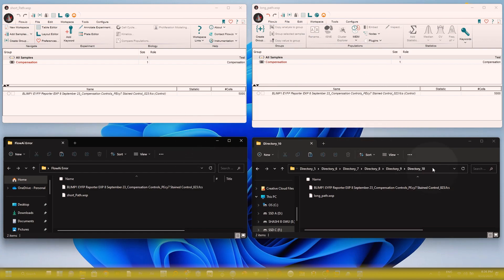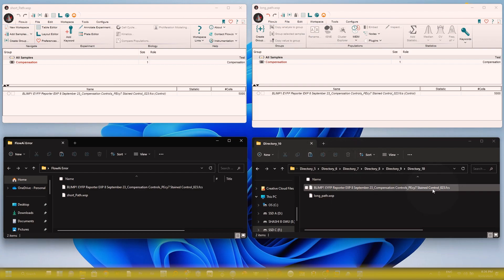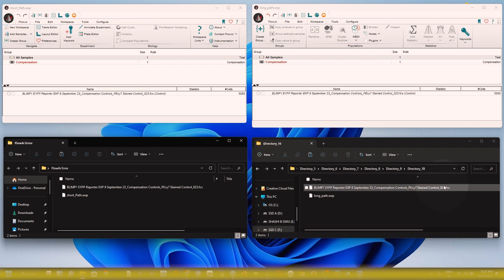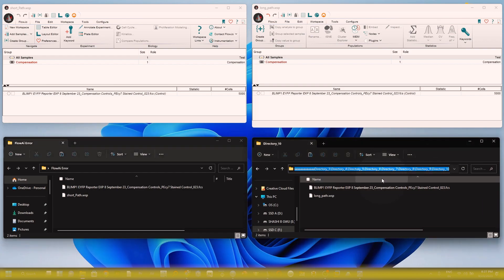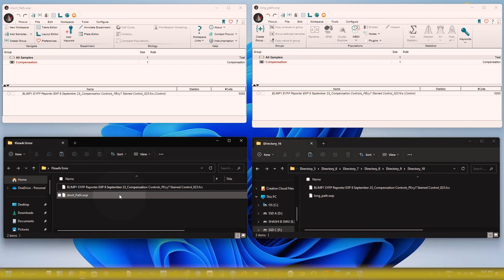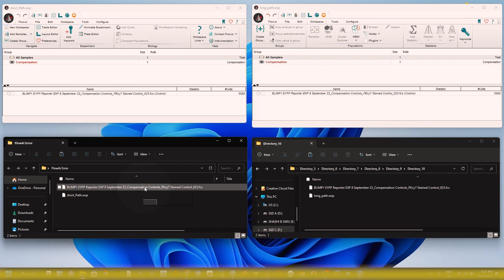So in the case of a long path — where you have saved your WSP file and FCS file in deeply nested subdirectories — this is where you will get the FlowAI error.